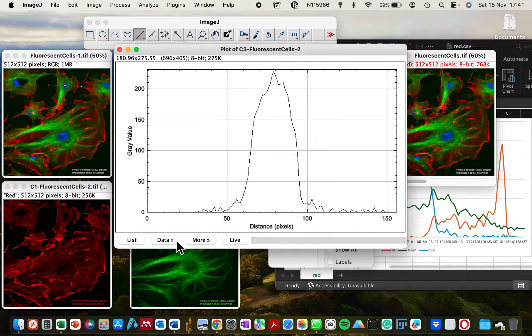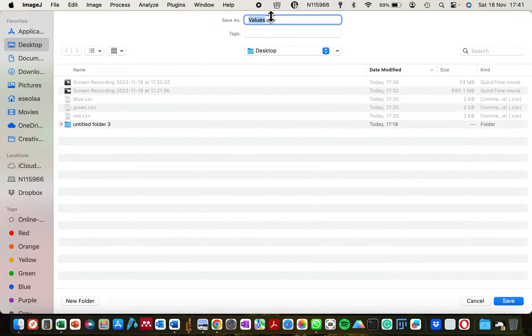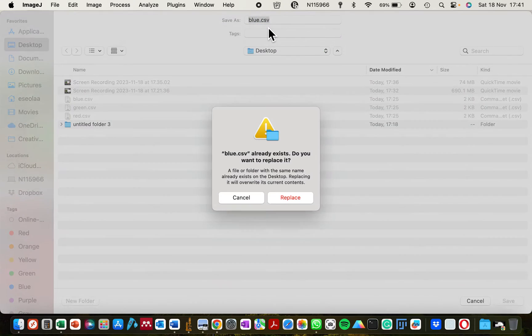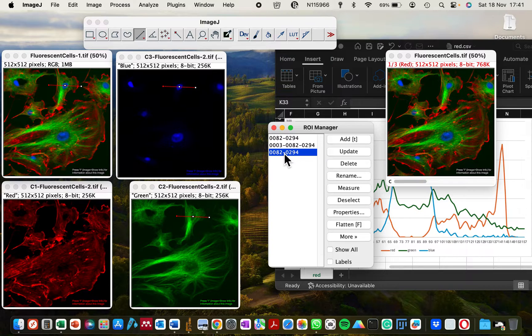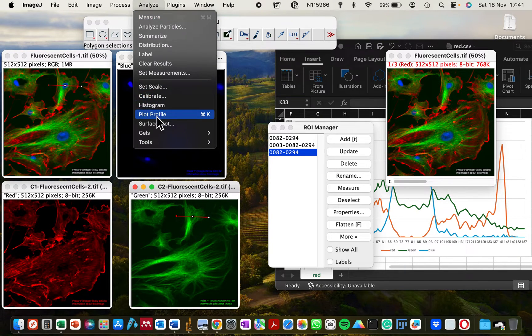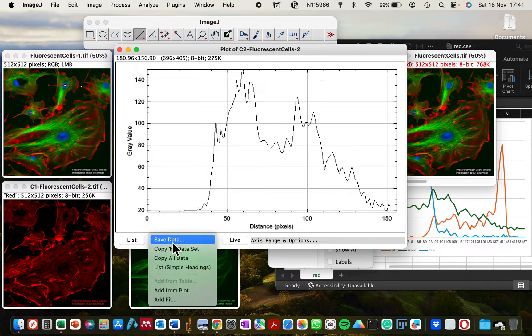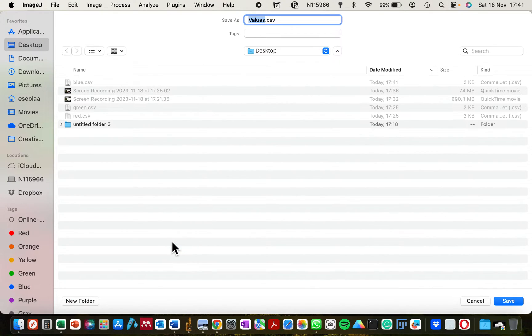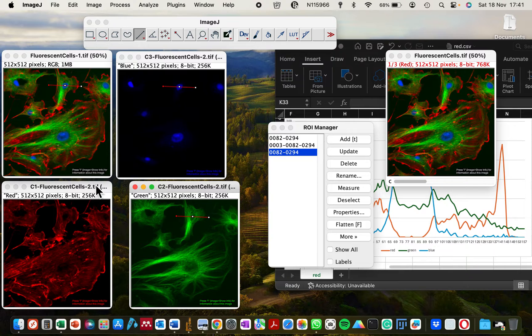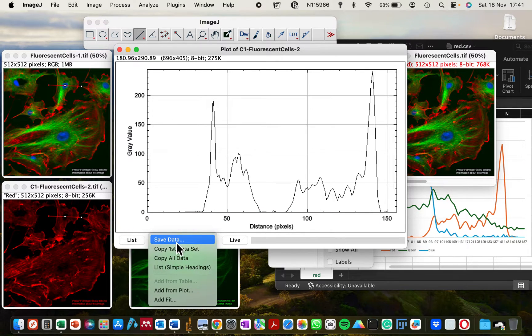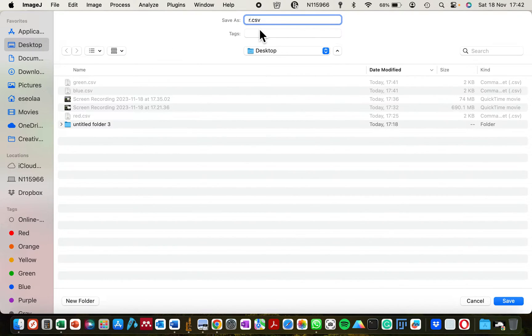I'll select 'Data,' click 'Save Data,' and save that as 'blue.' I'll close this data. Now I'll generate the same for the green channel by clicking on the region of interest coordinates, selecting it on the image, going to Analyze > Plot Profile, then selecting 'Save Data' to save it as 'green.' I'll do the same for the red channel: select the region of interest, Analyze > Plot Profile, then Data > Save Data to save it as 'red.'